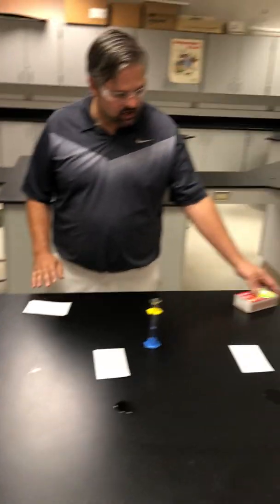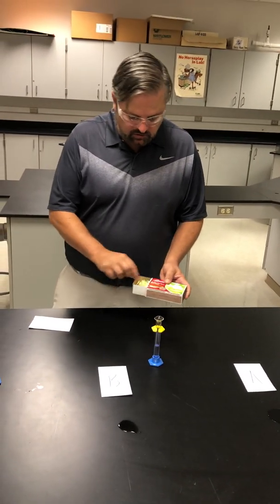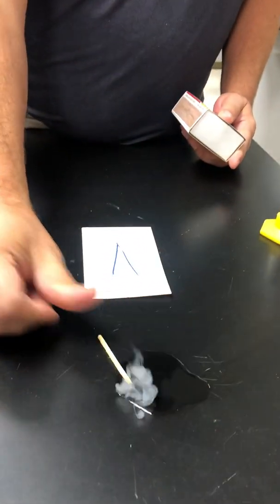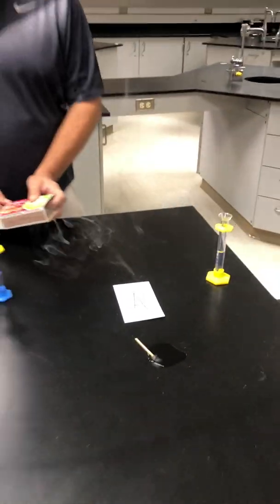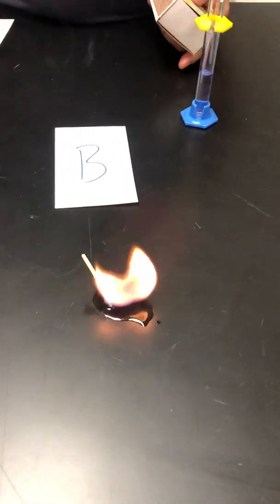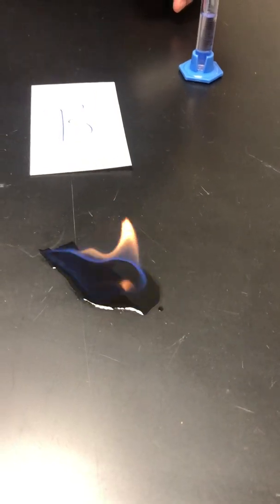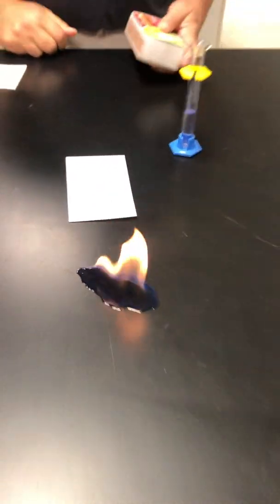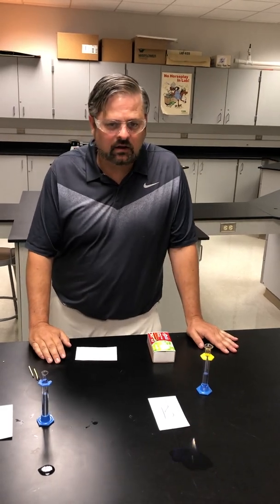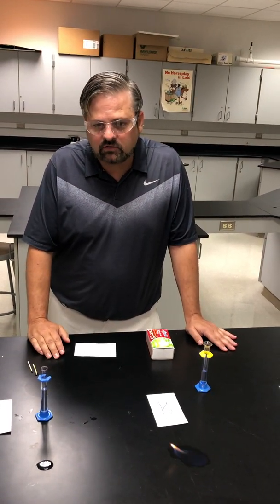And the last property we're going to check is flammability. So I got some matches here, and we'll just light the match. So here's substance A, not flammable, obviously. Substance B. Looks like that one's flammable. And substance C, not flammable. All right, so you have a number of properties that you can write down and then indicate whether they are intensive or extensive physical properties.